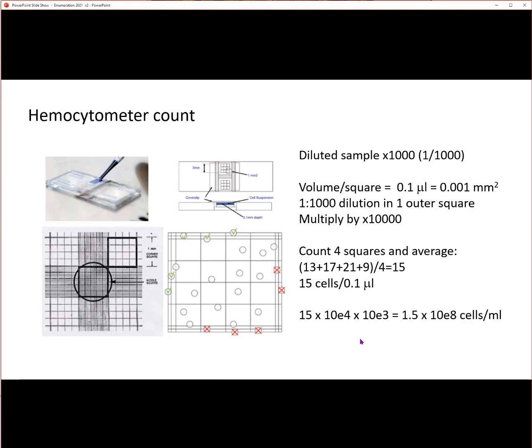Right, so this really wraps up the different ways of counting microbes, what we teach you, which is the dilution plate method, the growth curve, and the hemocytometer. Fairly simple, but again, very, very powerful methods for you to know to work in any microbiology lab, in the clinics, in the diagnostic labs, or anywhere else. I hope you get the main points, and it's not really hard, so I'm sure you can get it.